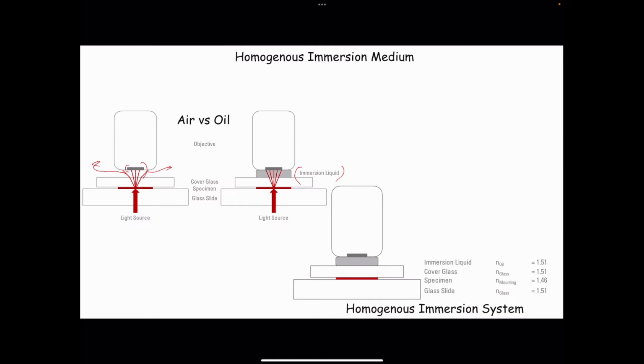your specimen. Now there is a huge challenge when we are doing fluorescence microscopy, in terms of sample difference. Let's imagine there are different types of samples which are amenable for fluorescence microscopy. When you are considering the refractive indices of the biological sample, you have to take into account that there is a slide here, then above that is your sample in between, and above that is your cover slip.